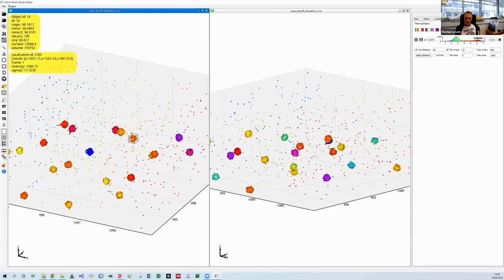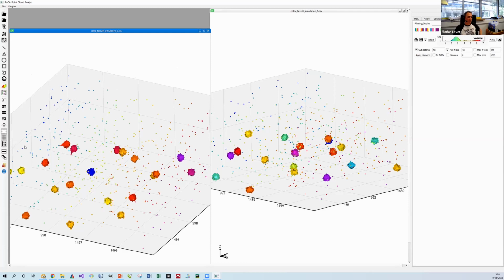So basically, every one of the commands of PoCA is recordable, except if I have some bug, but everything should be recordable. That means when you are done with your pipeline and you are happy with it, you should be able to save it and then apply it to new data directly. That's one of the things that I wanted to be able to do: defining a workflow and then just clicking on a button and it will apply the workflow on all the data that you have acquired.